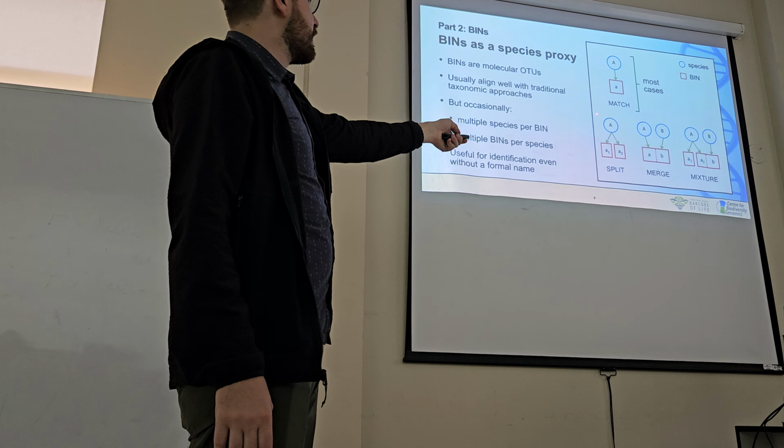Okay, so here's where you can see where the specimens are held. All of them are here. Probably just a bit of DNA or a bit of tissue was mailed to the University of Guelph, and then we kept that, but the specimens are all here. So if you wanted to find those butterflies in the picture that he posts us, you can just go to the museum and talk to an artist. Okay?